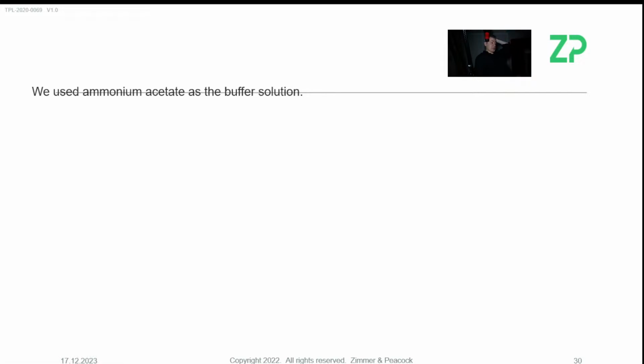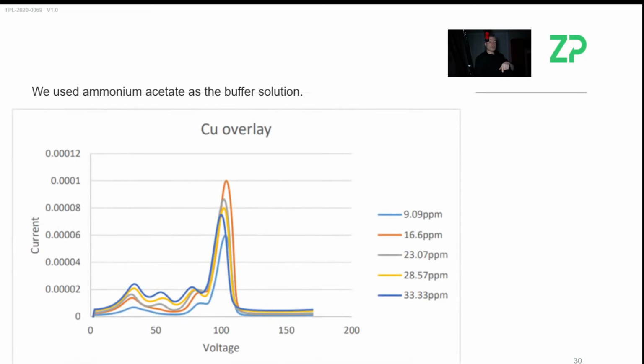And it's because I think you're in ammonium acetate. We're not in ammonium acetate. So the big difference between you and us is we're both using the same screen printed electrode. We're both using anodic stripping voltammetry, except you have these peaks and we don't have these peaks. So I think ammonium acetate might be the clue.